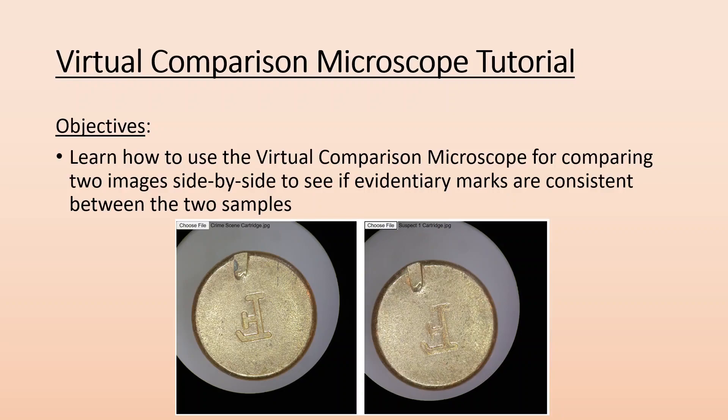How's it going ladies and gentlemen, Mr. Donnie here again. This time we're going to take a look at a quick tutorial on how to use the virtual comparison microscope that I threw together. The objective is to learn how to use this virtual comparison microscope for comparing two images side by side to see if evidentiary marks are consistent between the two samples.